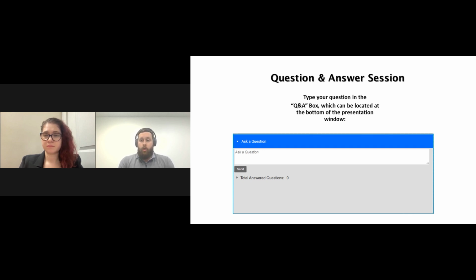So currently all Shimadzu GCs, not only the GC-2050 but the GC-2030, have an inline split filter. This split filter is a consumable that can be changed by customers. It's very easy to access on the backside of the instrument, and it's a toolless change as well. So we do treat that as a consumable for those customers looking to run some toxic samples.